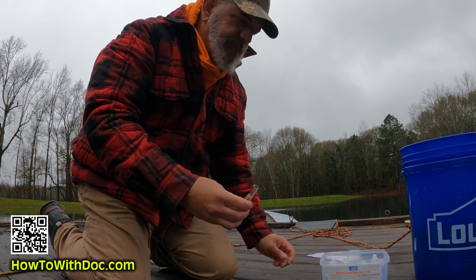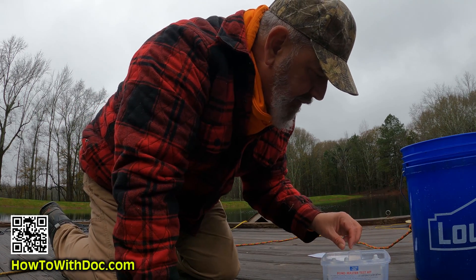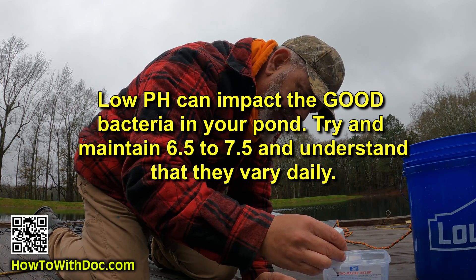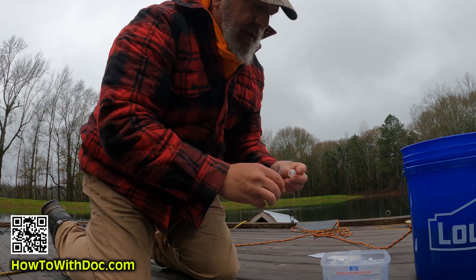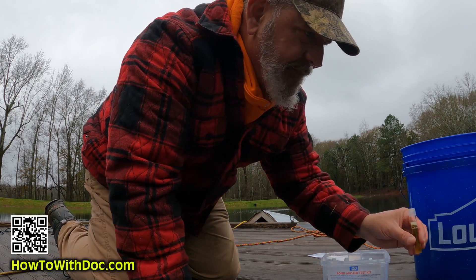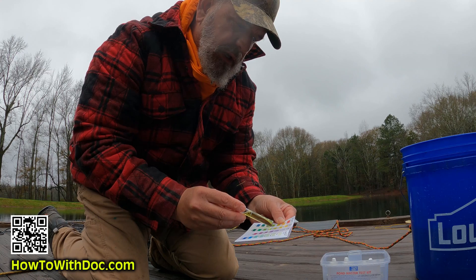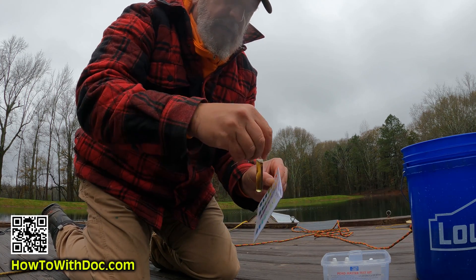I'm going to fill the vial to the five milliliter line and put it on a flat surface. For pH wide range, I add five drops — one, two, three, four, five. Cap it, don't put your finger on the test tube because it can skew the results, and shake it. Let it sit for about a minute until it forms its color, then compare it to the color chart. I'm at about 6.5 on my pH.